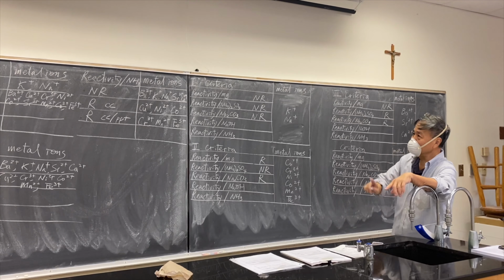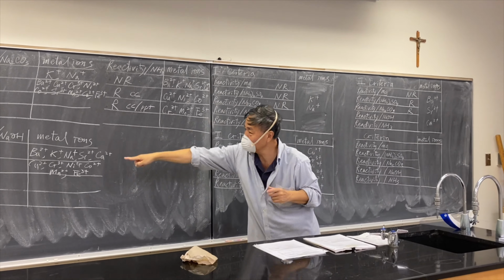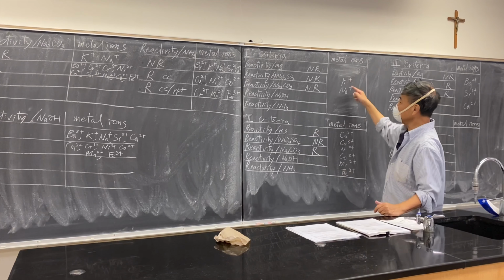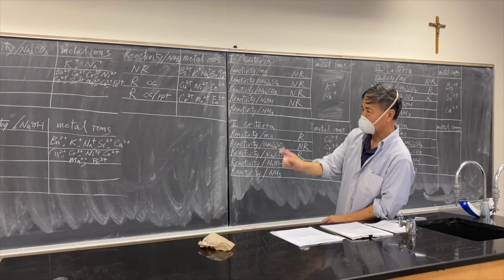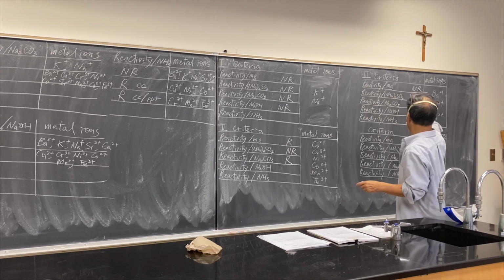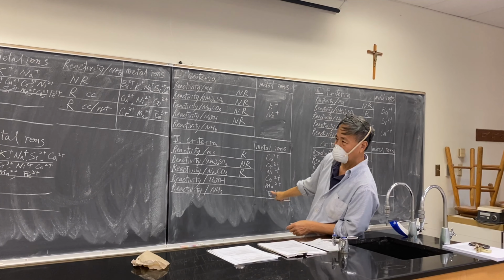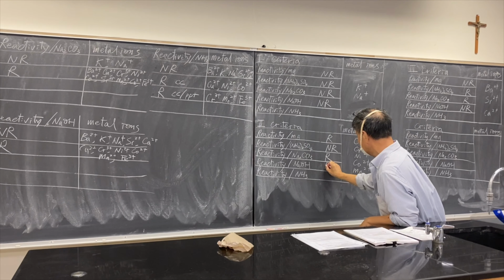Then move to your fourth one, which is our fourth table right there. It says the reactivity with the sodium hydroxide. 1, 2, no reaction. And then 1, 2, 3, barium, strontium, and calcium, no reaction. So those three, no reaction. And how about those 6? Right there says reaction. Then you say reaction.